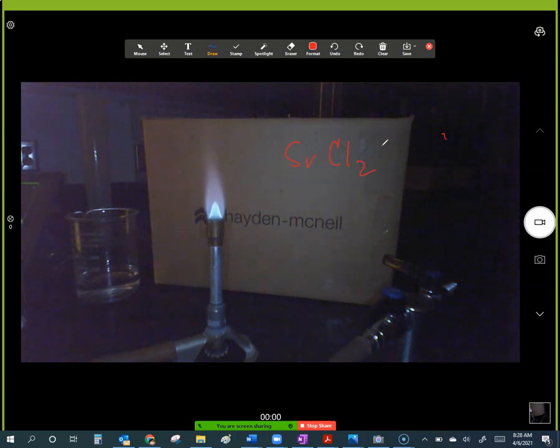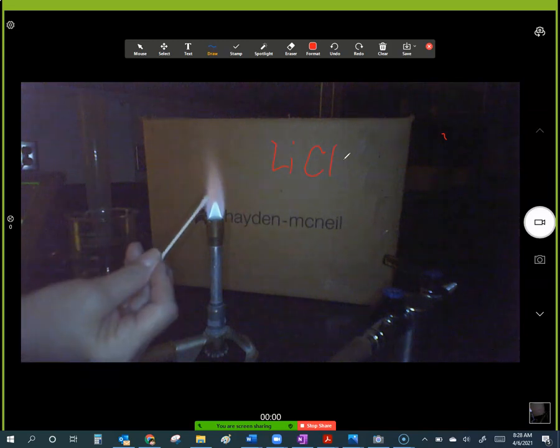All right, here is lithium chloride. Oh, that is really disappointing.